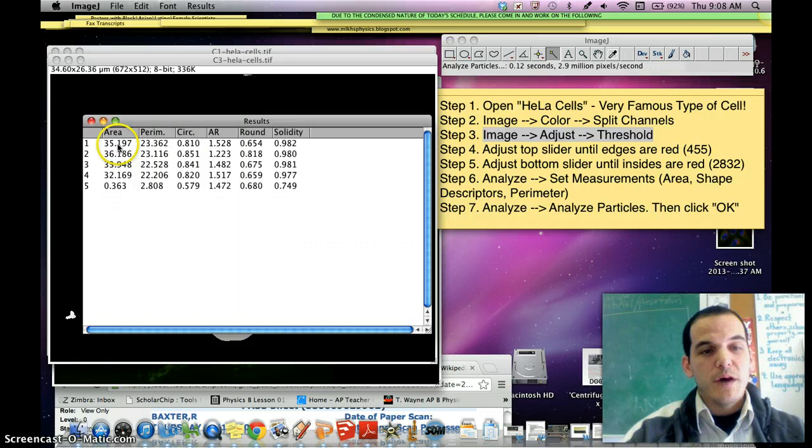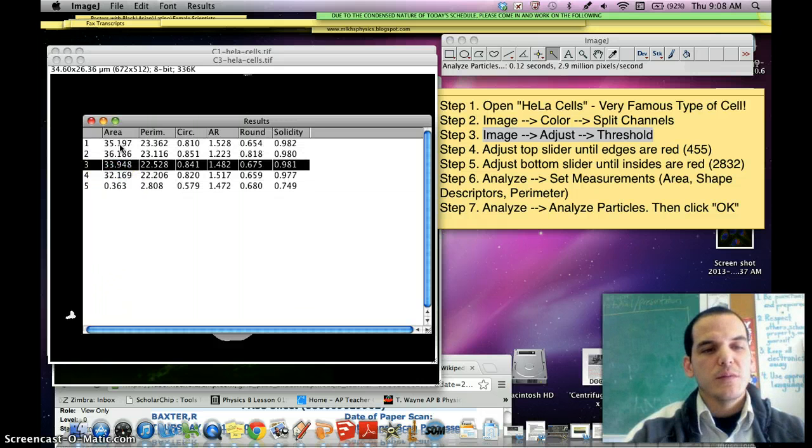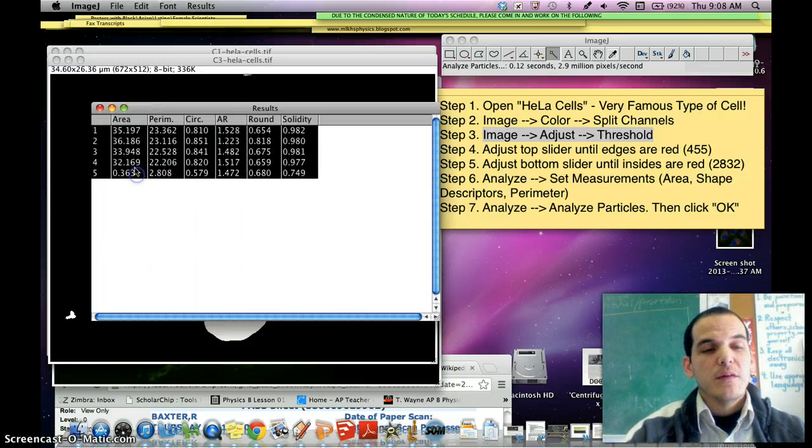So your final steps for today will be to analyze the average of these particle areas and to notice that there are some major differences in the values. So without giving away the answers to the final 5 questions, this should be the final step before you fill in your table and then provide your interpretation of each of those 4 variables.